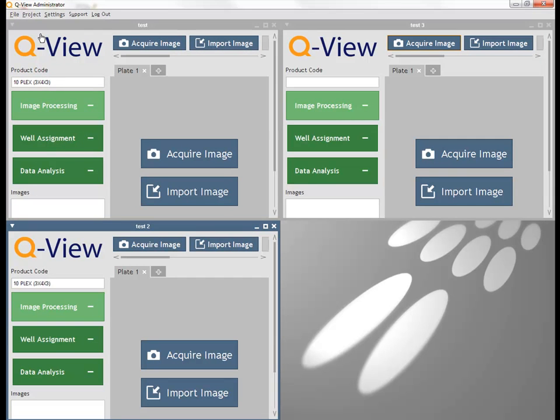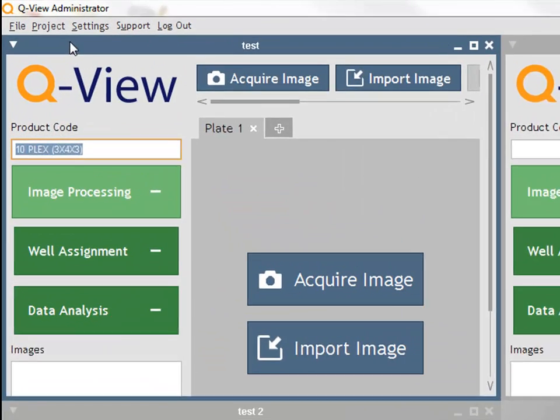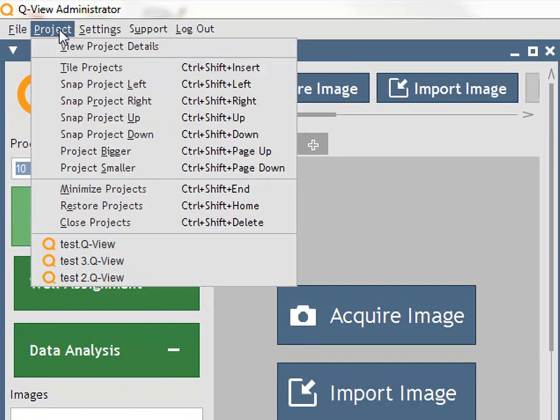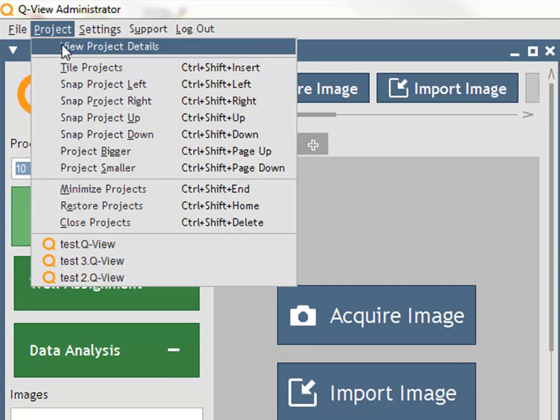To view project properties, click Project, View Project Details. You can view when the project was created and by whom. You can also view who has accessed the project.